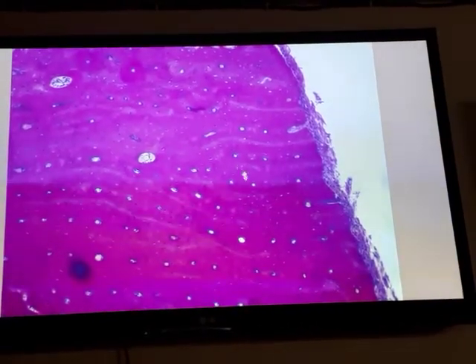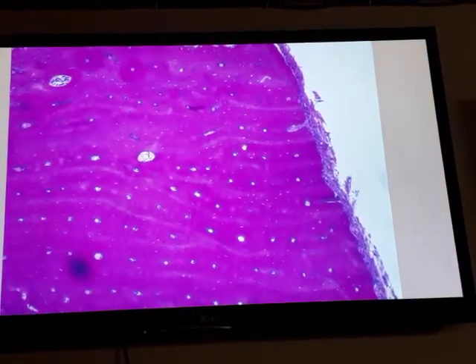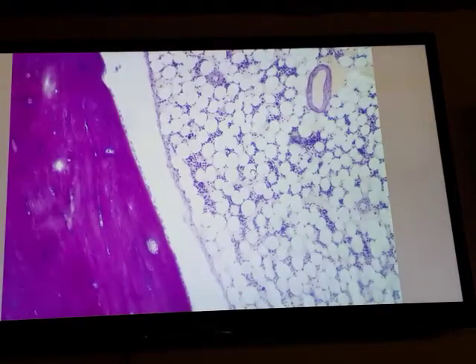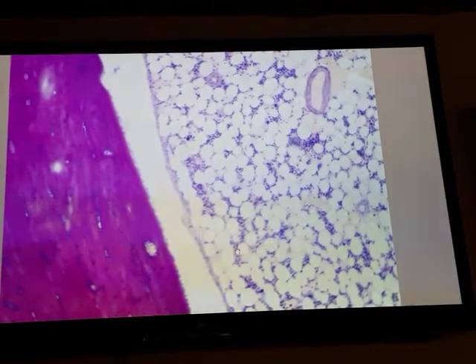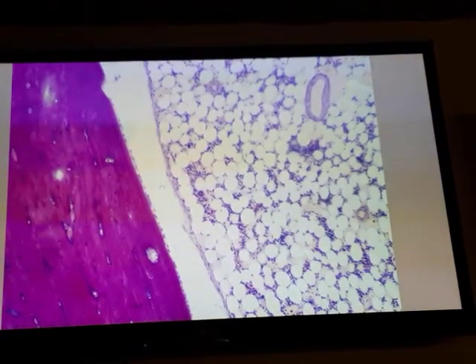These are Haversian systems or osteons, with a central Haversian canal surrounded by concentric laminae. On the inner surface of the bone around the marrow cavity, we have the endosteum — a single layer of osteoprogenitor cells with a small amount of connective tissue. This is endosteum, and this is bone marrow tissue with adipocytes.